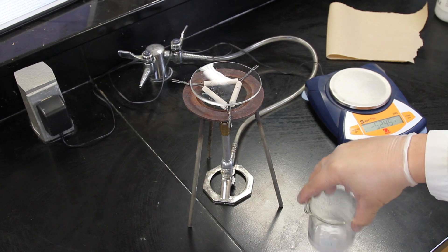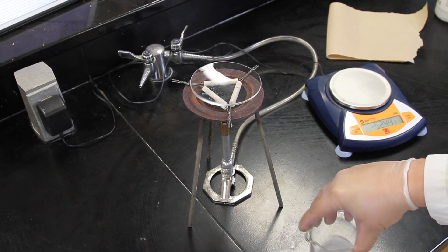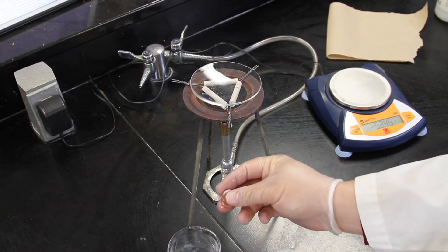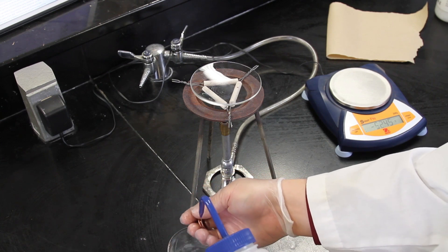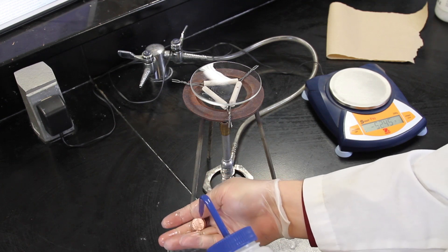Swirl the pennies in the solution for 30 seconds or until they look clean. Rinse the coins with distilled water and set them on a paper towel to dry. To prevent oil from your hands getting on the coins, try to avoid touching them with your fingers or use a pair of gloves.